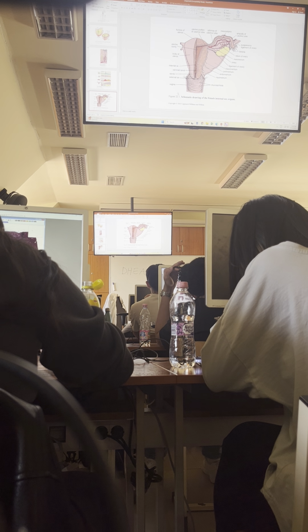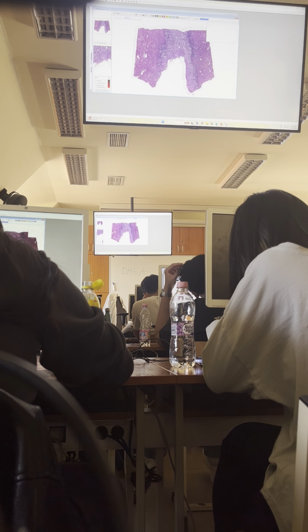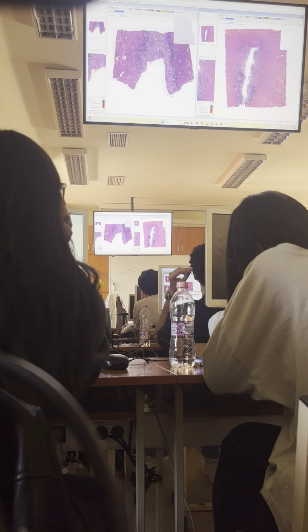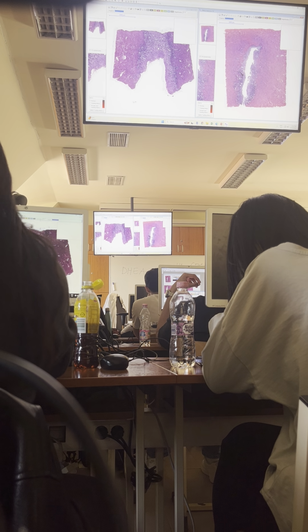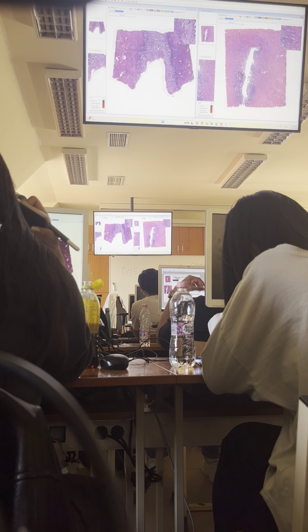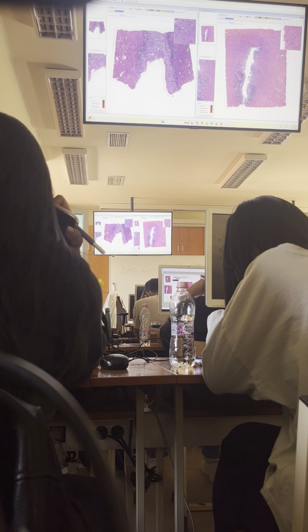Now, let's look at the section. So, if you compare, both look like kind of male underwear. This is like a pant. This is also like a pant, but this is a big one and this is a small one. Okay, so these are the thighs here. Here also. Here is the testis.